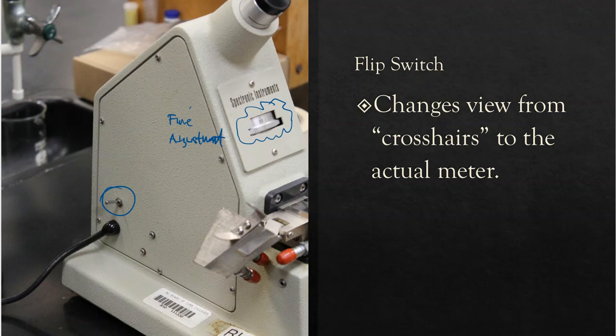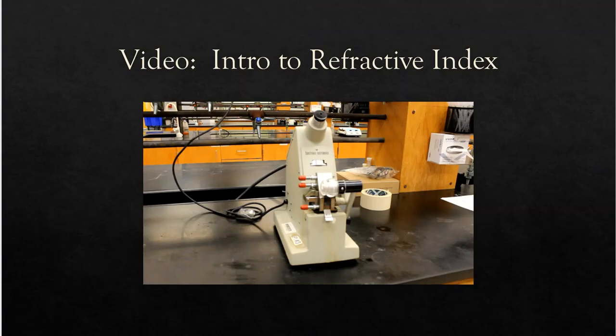So the main adjustment dial to the right, the flip switch to the left, and the fine adjustment tool on the front. And folks, that's all there is to using a refractometer. All right, so what you're going to see here is a video of me going through these pieces and parts again, but I'm doing it live. So that way you can actually watch me as I demonstrate and explain it.